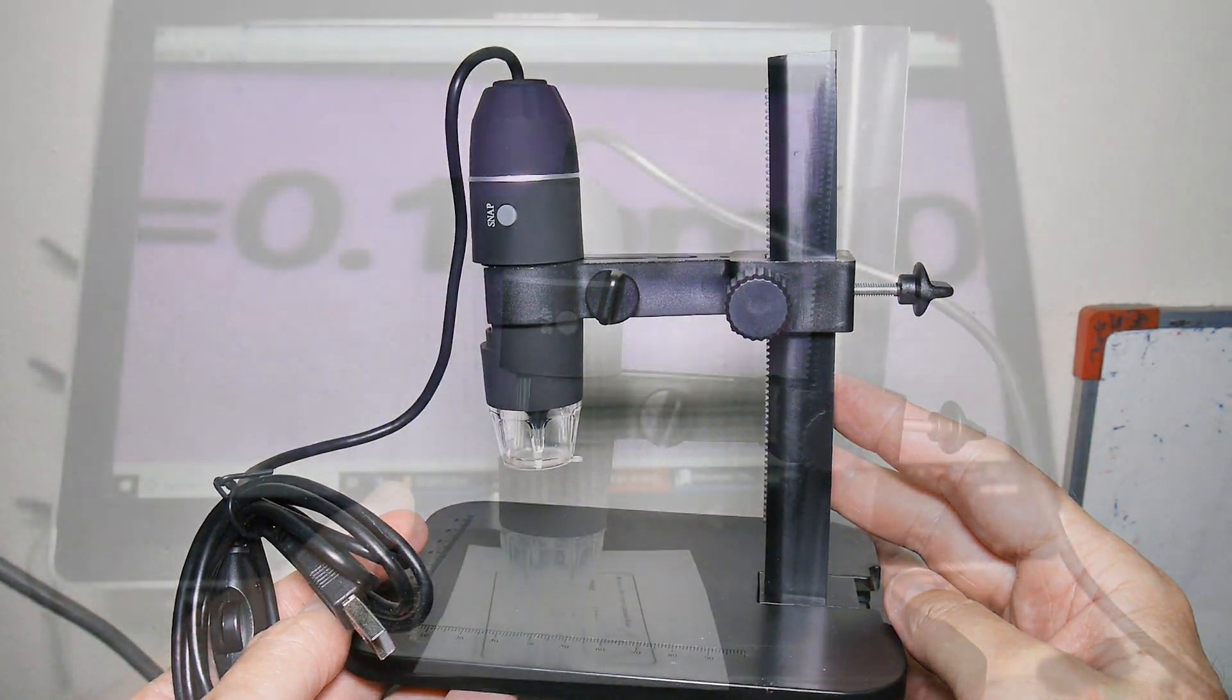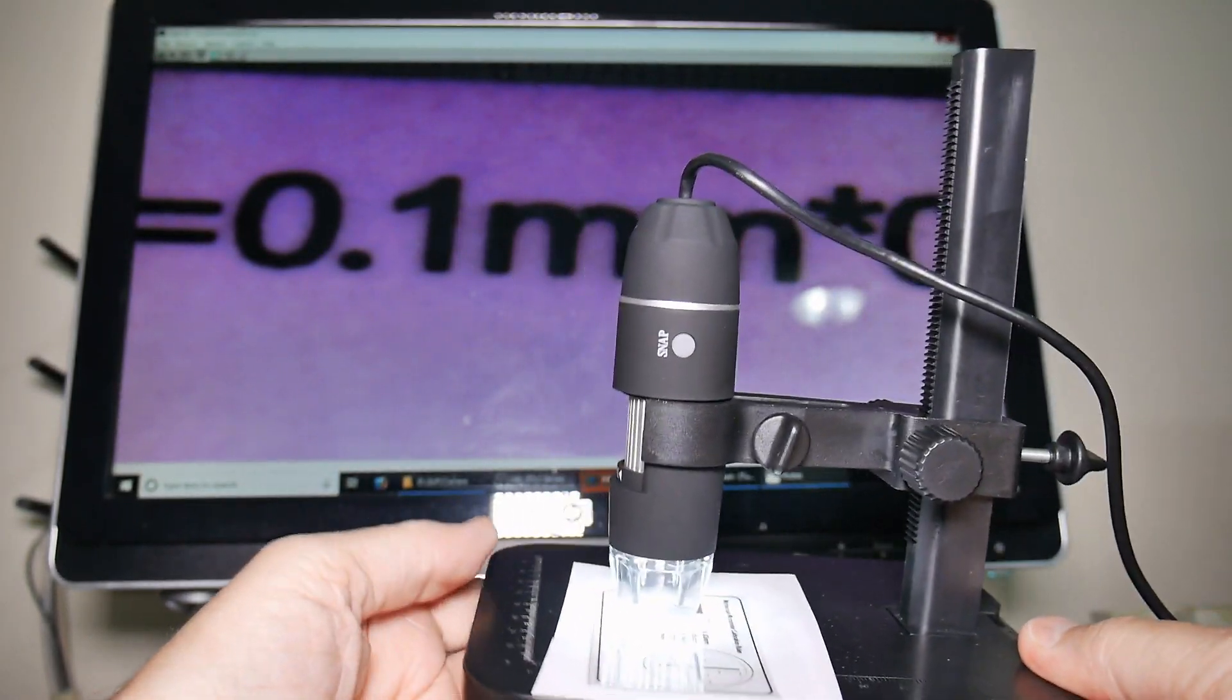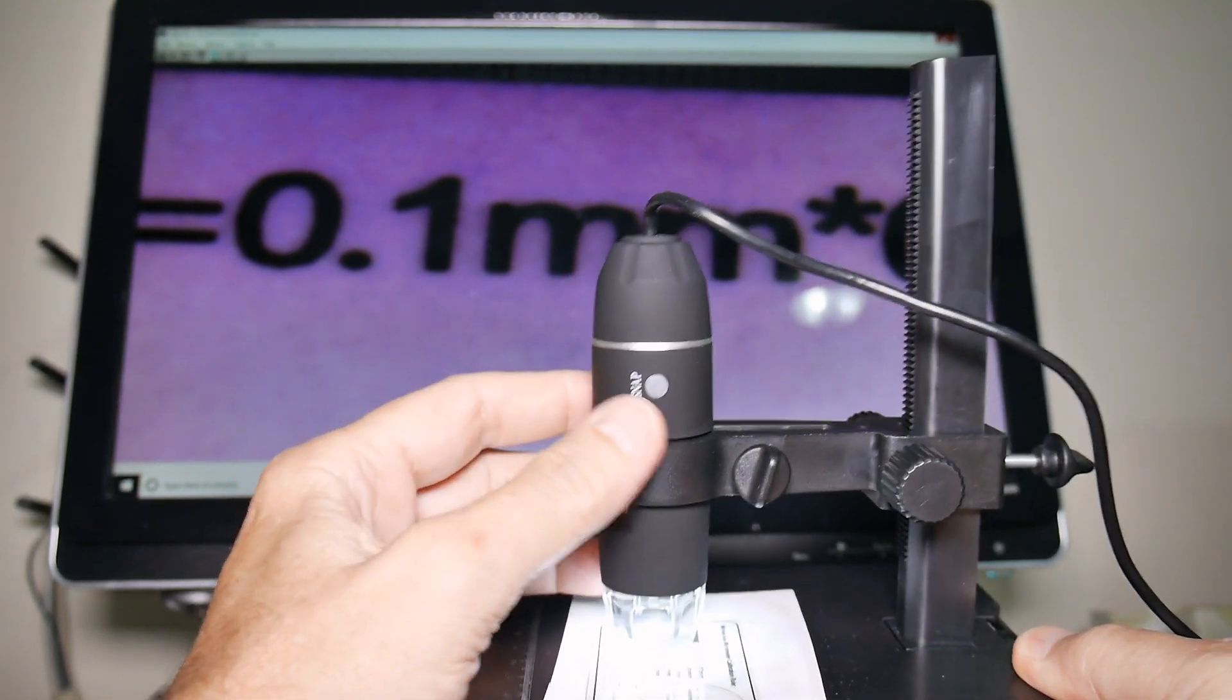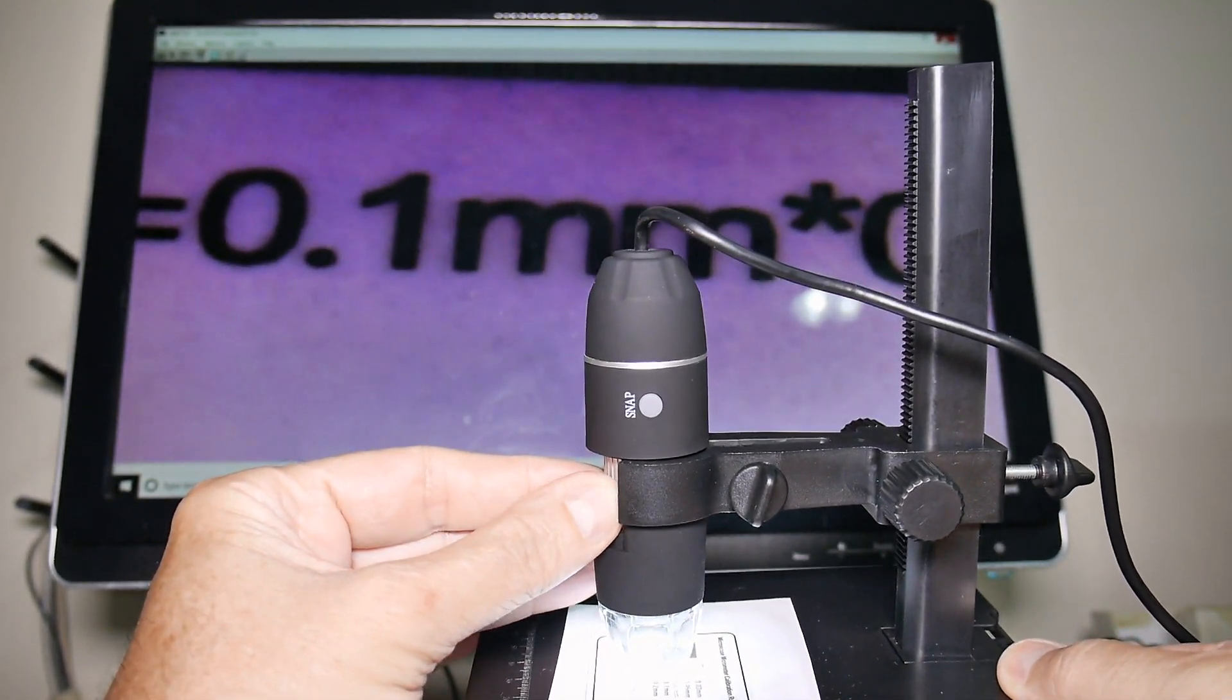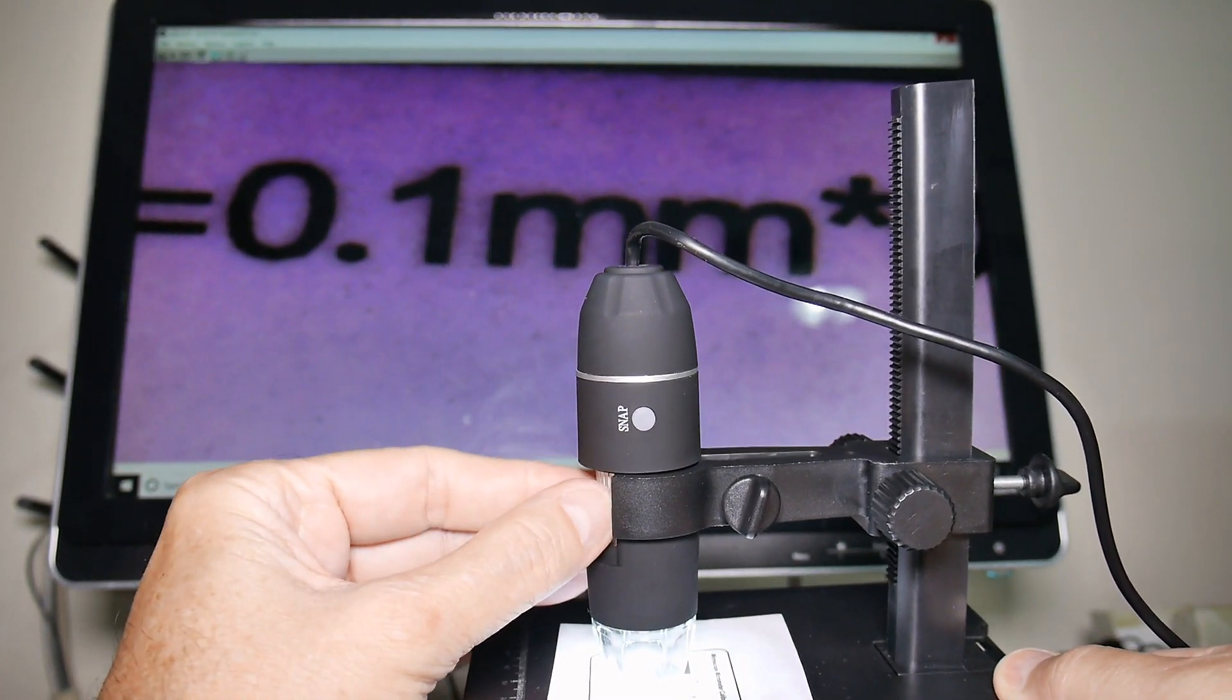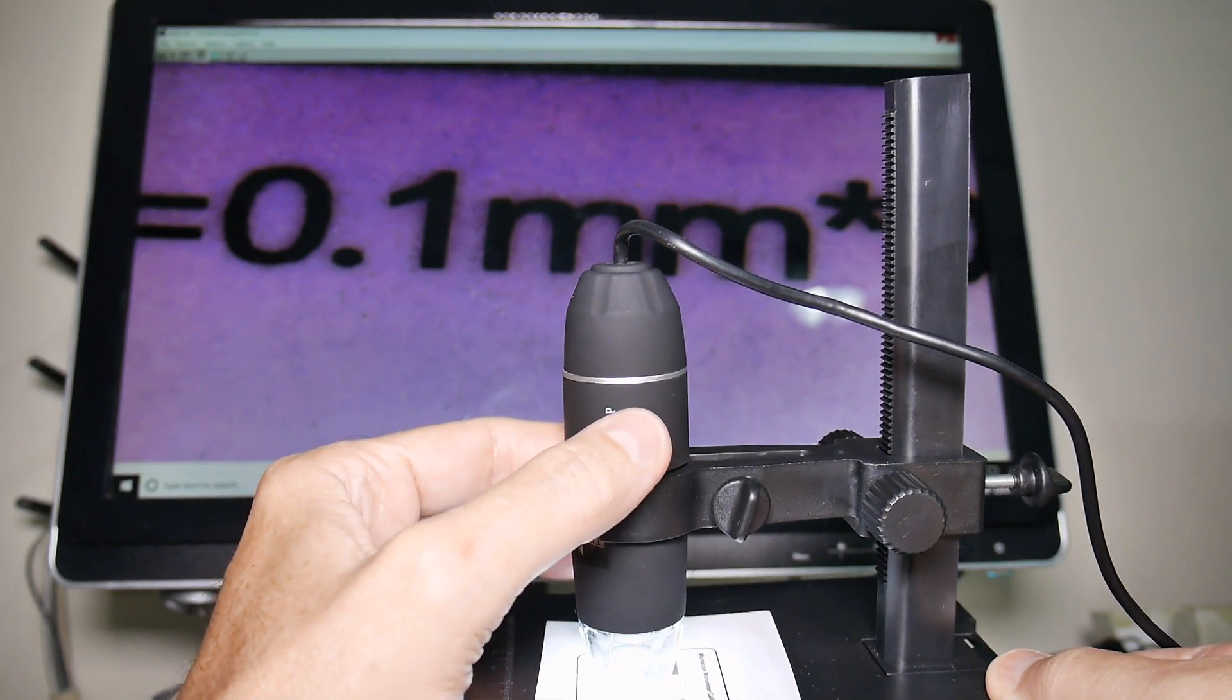This is the microscope in operation. You can see in the background, this is the focus right here - this knob right here. You can see it getting sharper and not. That's not too bad.